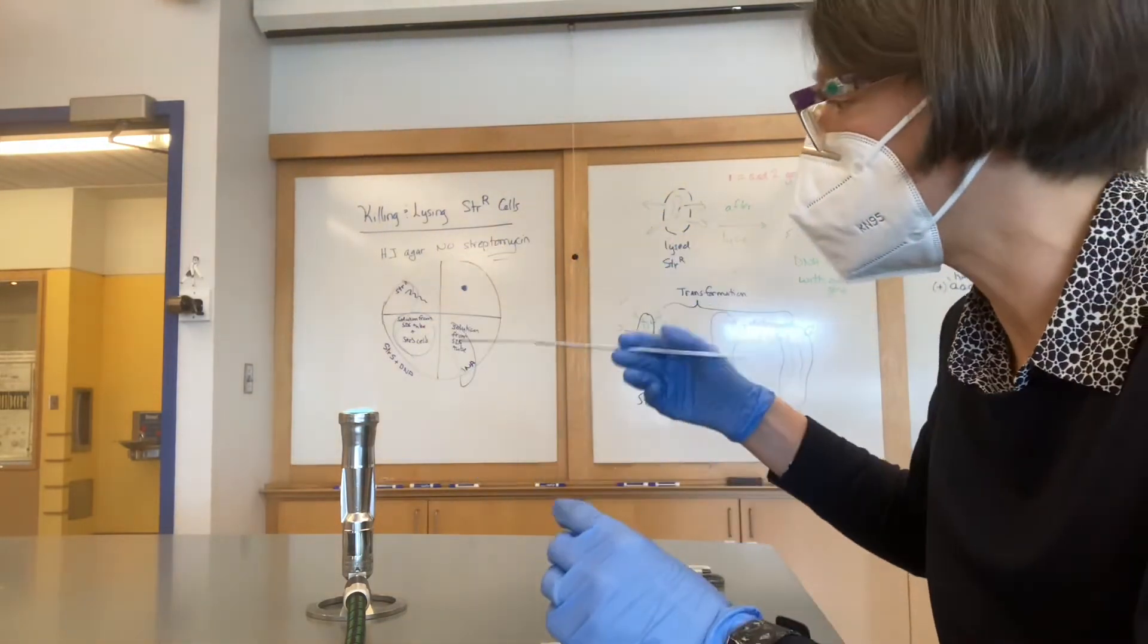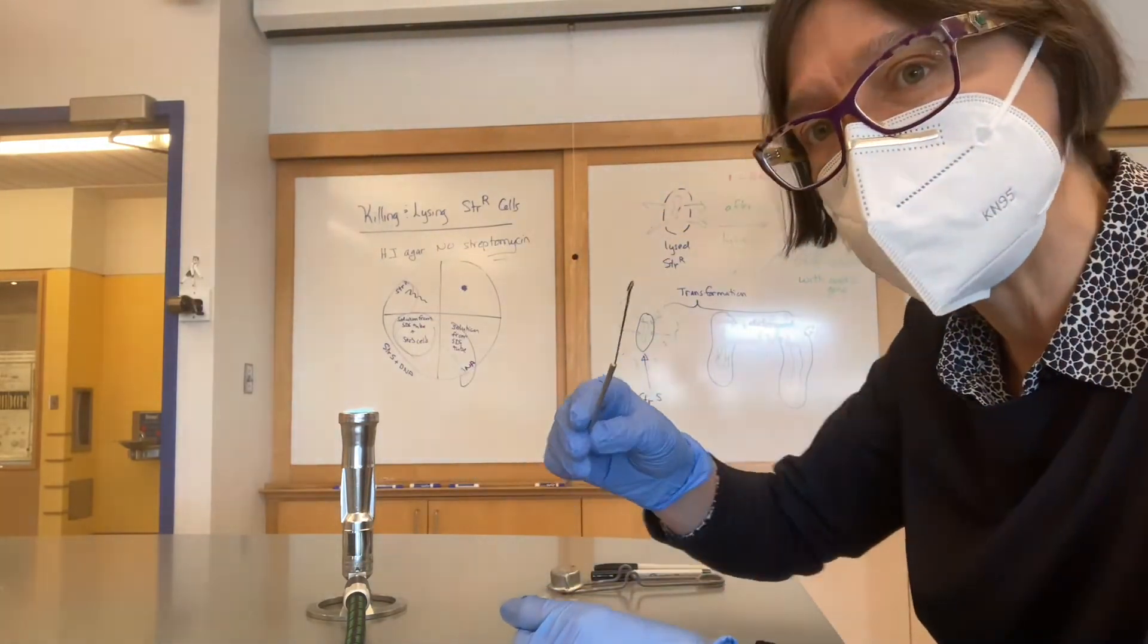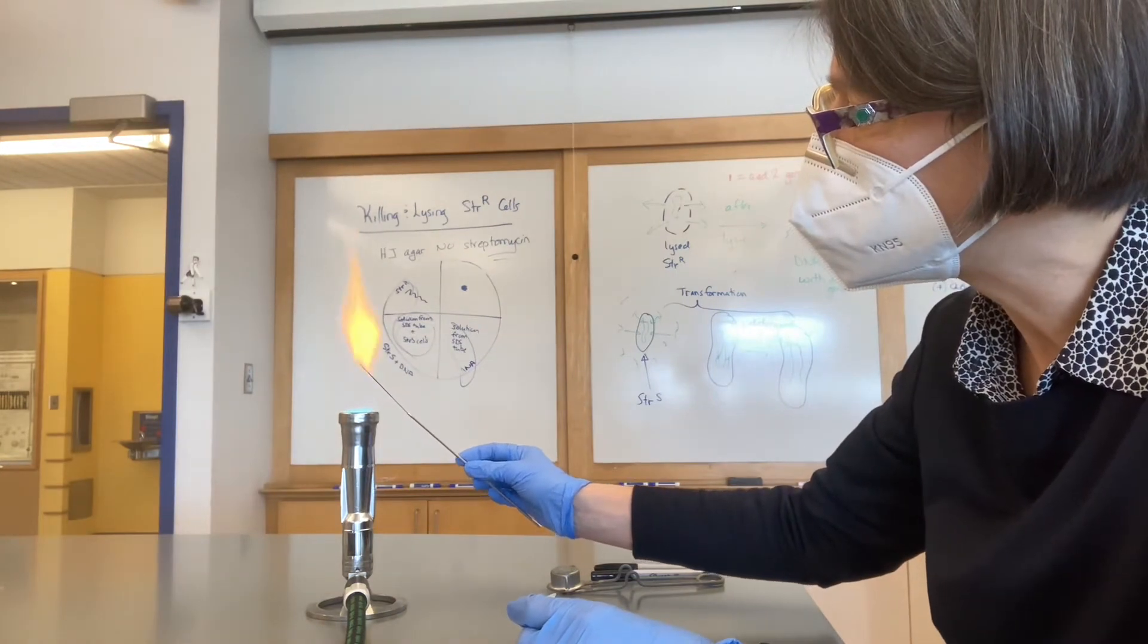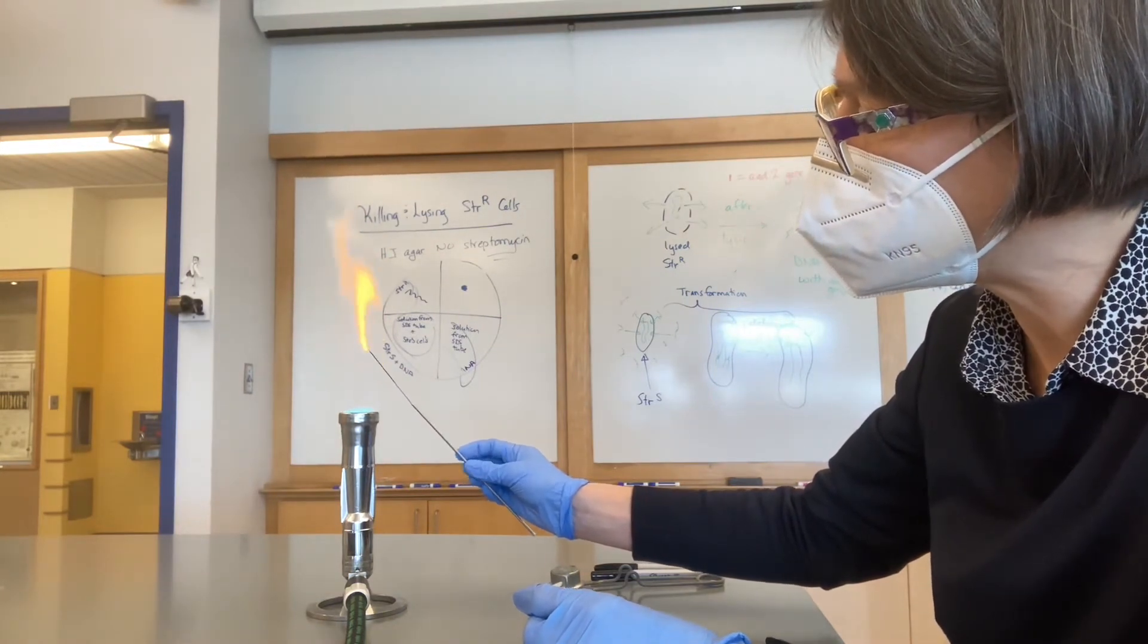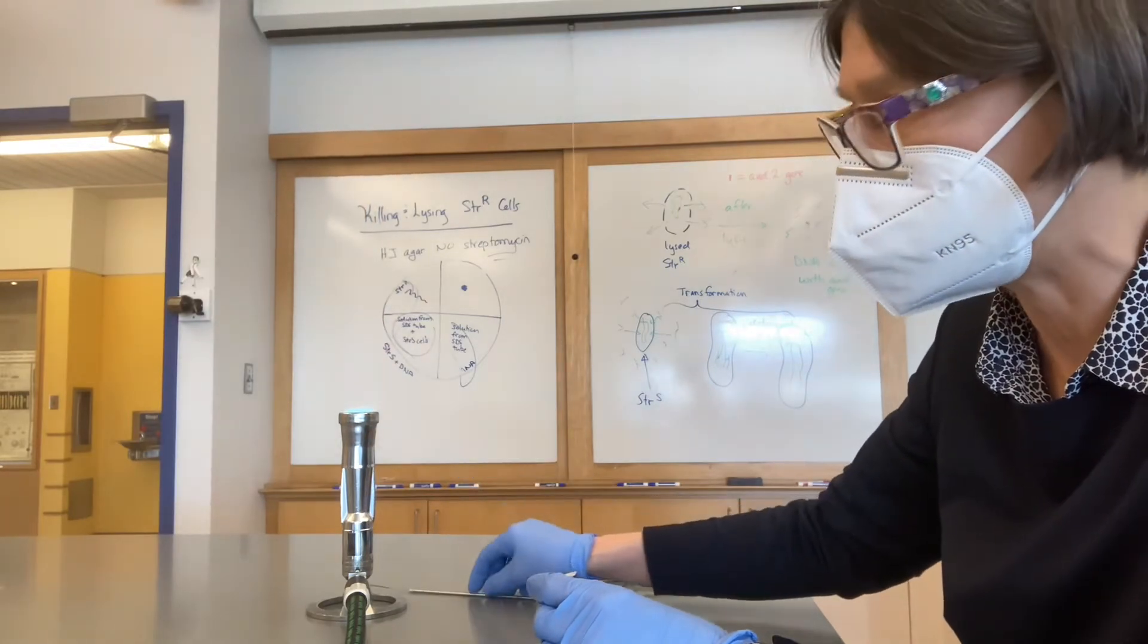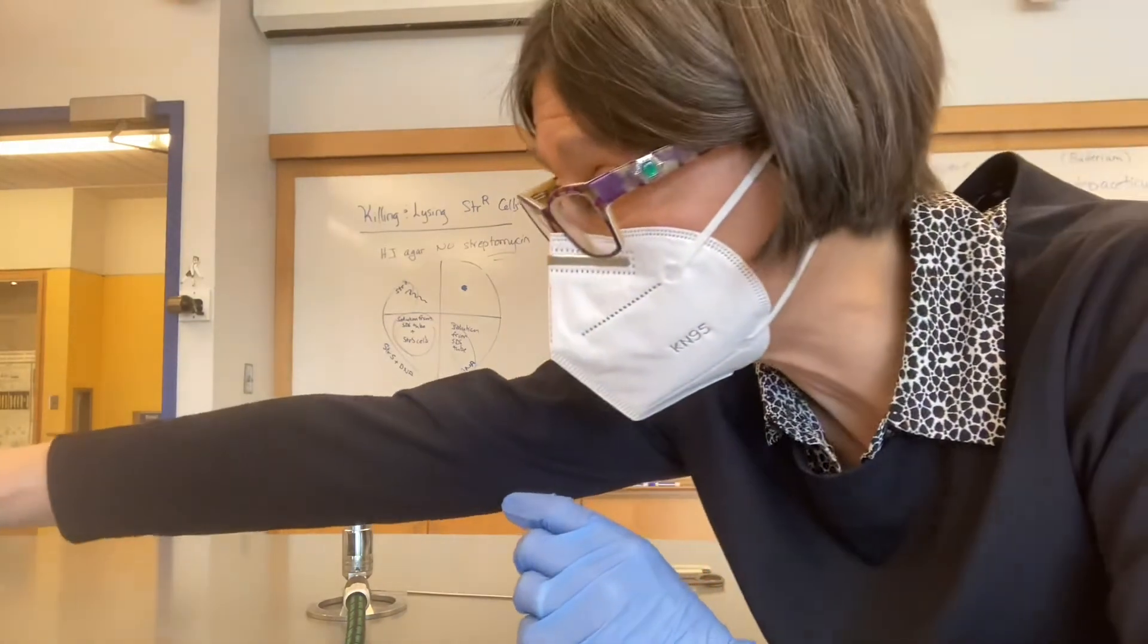I cap the SDS tube, and this is contaminated now, so I flame it. And once it gets red hot, burning off any cells or SDS on the end of it, I can lay that down. I'm going to turn my Bunsen burner off.